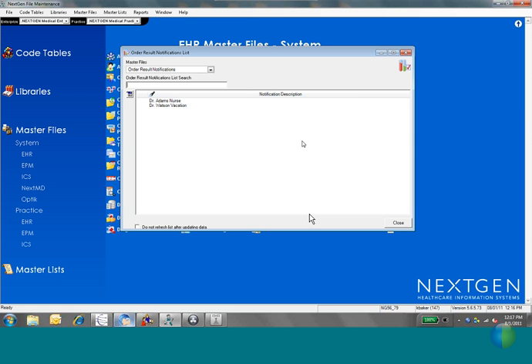In this case, if you were choosing to do the tasking, you can have the tasks routed to additional users for just certain reasons, like maybe you always want to have somebody's nurse notified when that provider receives results, or maybe that provider's on vacation, so you want to have their results forwarded to somebody else.